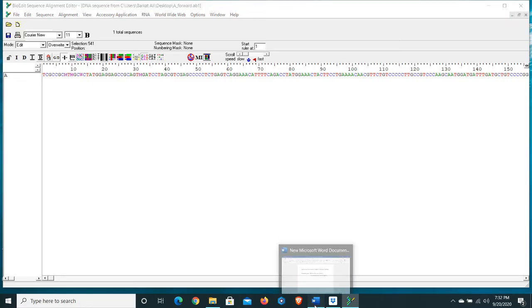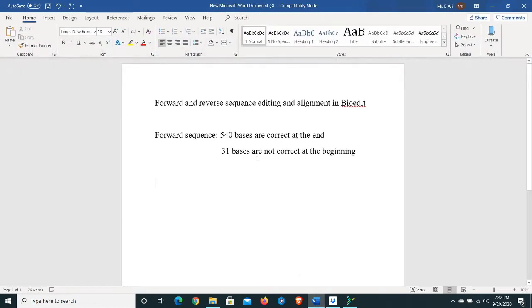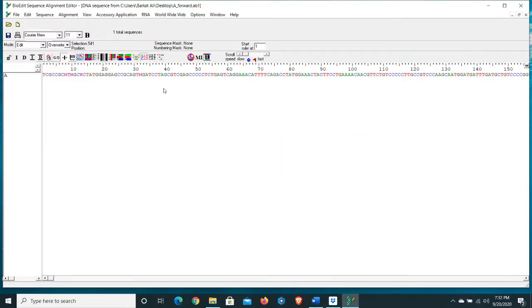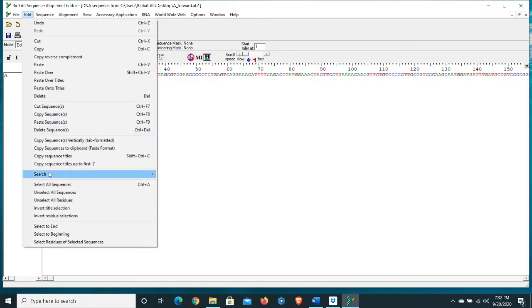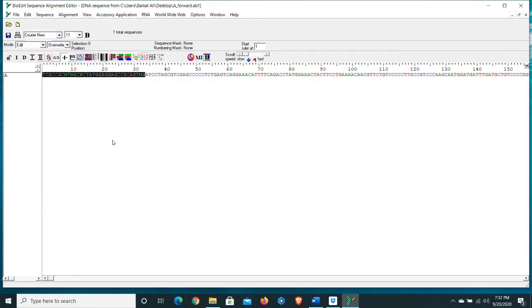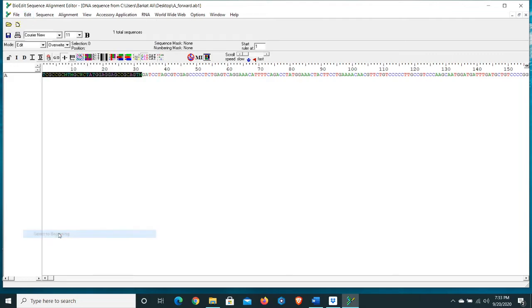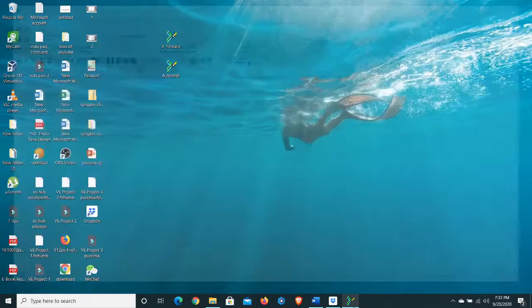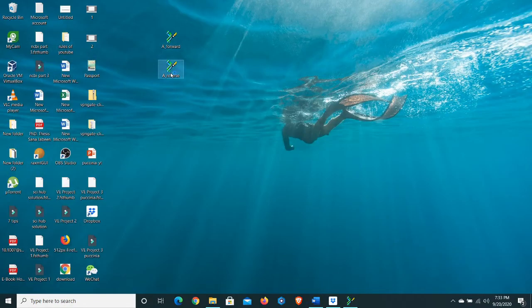Come back to the beginning of the sequence and check your data — 31 bases are not correct at the beginning. So mark position 31, go again to Edit option, select 'Select to Beginning', and press the Delete button. Now we have edited our forward sequence.